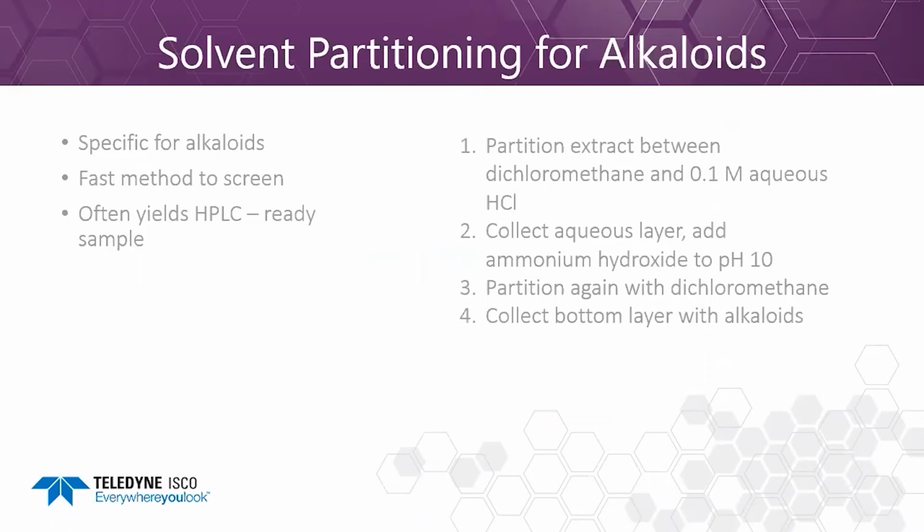Another common partition is one for alkaloids. It takes advantage of the fact that these compounds are basic. This works for most alkaloids. However, test all extracts and phases before discarding anything. If the active compound is an alkaloid, it is possible to purify and identify the active compound very quickly with this procedure. And I will show you an example later in the seminar where I go straight to SFC.